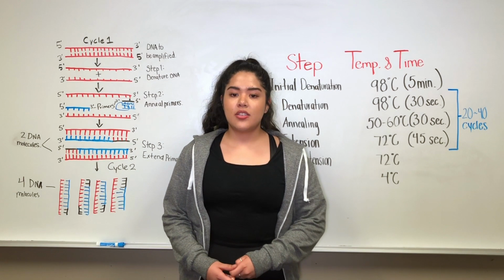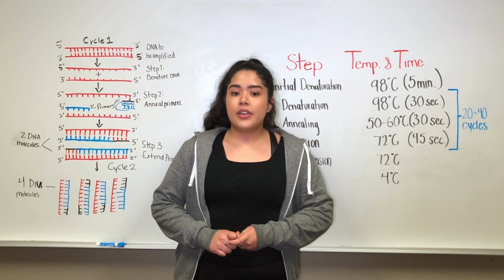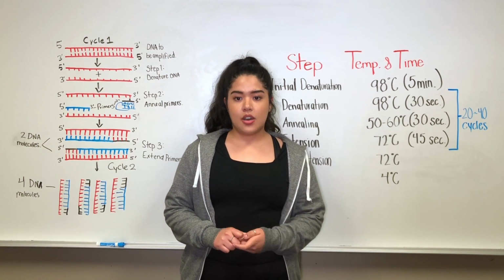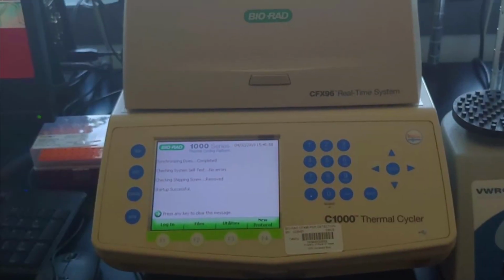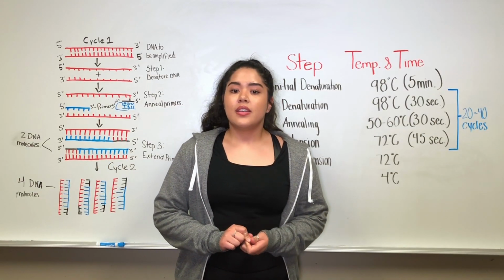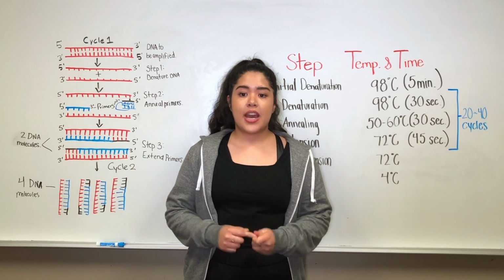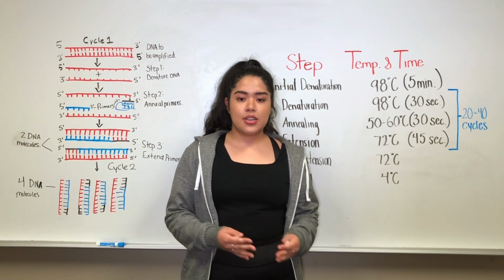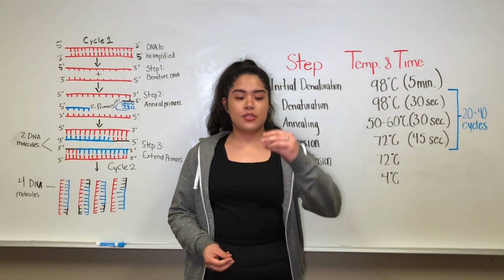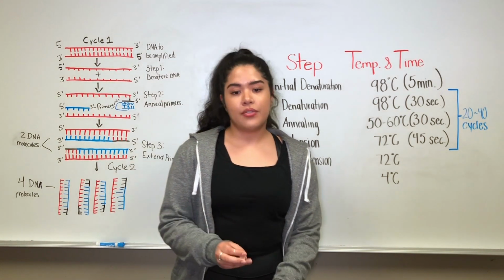The first step is to generate complementary DNA, or cDNA, using RNA with the help of an enzyme called reverse transcriptase on a thermocycler for 60 minutes at 37 degrees Celsius. Then, the RT-PCR reactions are set up by adding a cocktail mix of TaqMan, forward and reverse primers, TaqMan probes, the cDNA you generated, and water into a microcentrifuge tube. And this tube is microcentrifuged briefly.